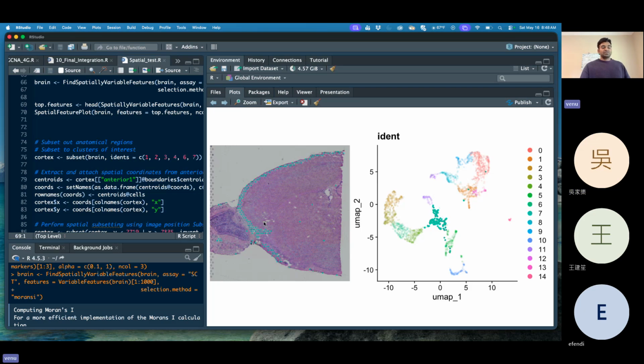Yes, that is where our next part will come. Right now we cluster these spots, similar spots with similar expression. Within the spot, again, there are cells. That is where deconvolution methods will play a key role. They will identify what proportion of cells is present within the entire region. For suppose, from here until here these are all top epithelial cells, but in this region, even the epithelial cells are shared with other cells.